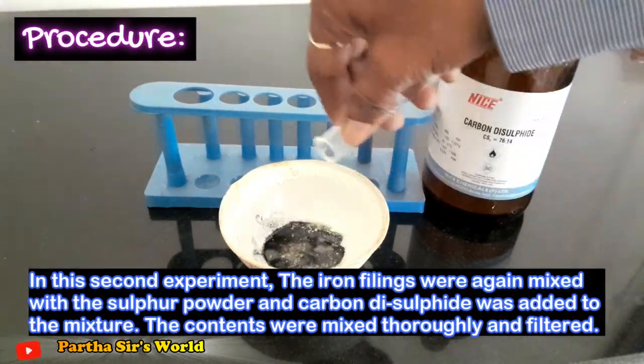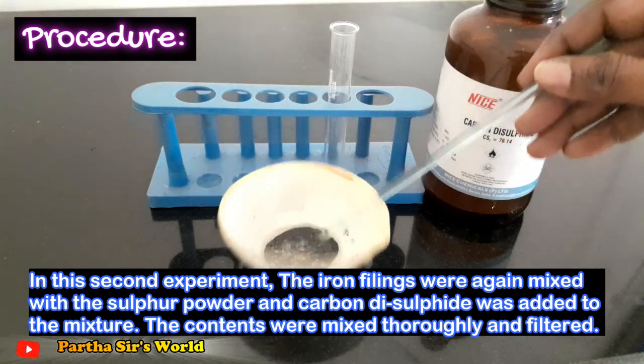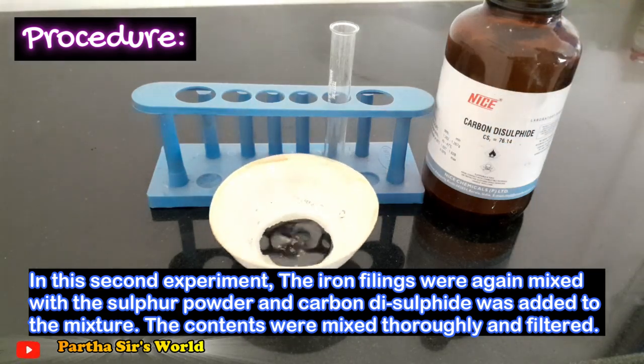In this second experiment, the iron filings were again mixed with the sulfur powder and carbon disulfide was added to the mixture. The contents were mixed thoroughly and filtered.